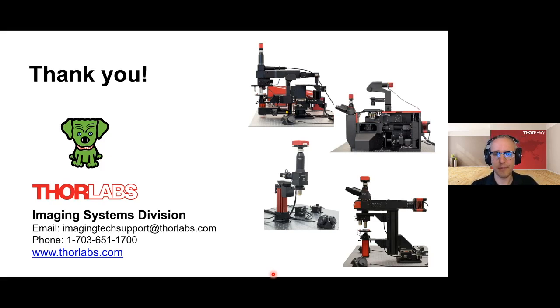Okay, going to the next. How does dispersion affect the image? This is very nicely reviewed in the multiphoton laser scanning talk, I believe the first talk in our webinar series. In multiphoton imaging, the lasers are pulsed, and each pulse, being short, has different wavelengths of light.